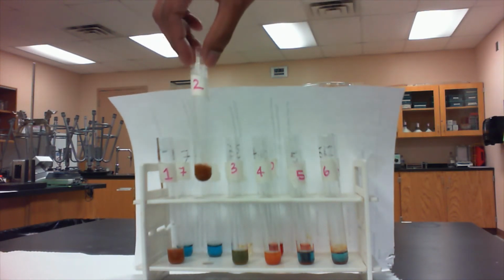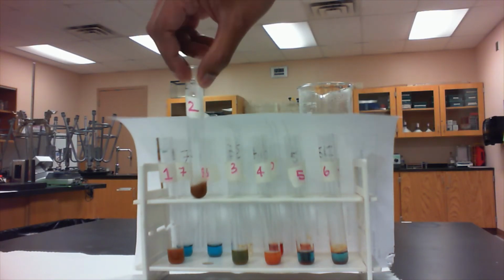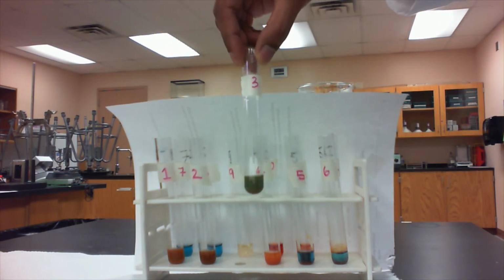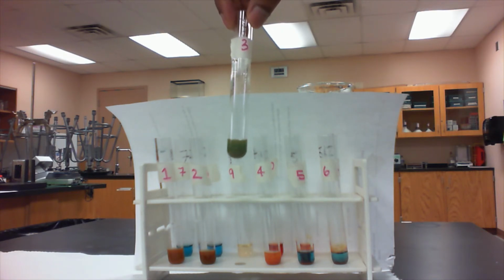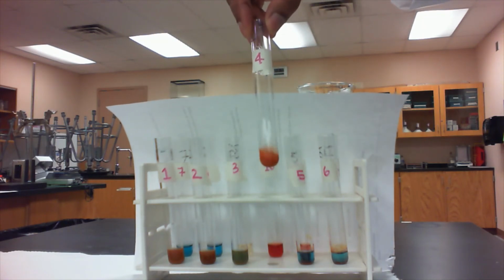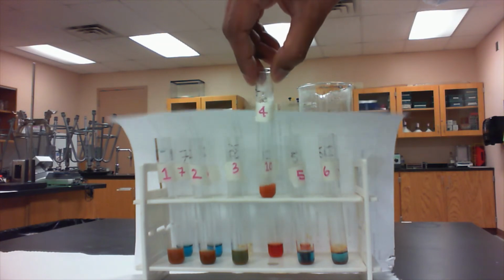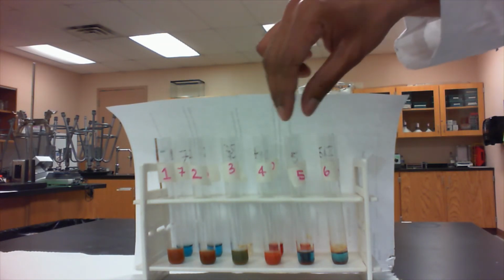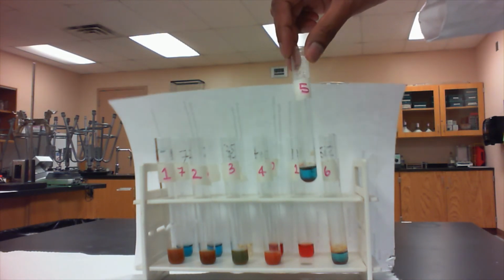This is test tube 2. Test tube 2 was fructose in the Benedicts reagent. This is test tube 3, which had sucrose in the Benedicts reagent. And this is test tube 4, which contained lactose in the Benedicts reagent, right? So remember, the Benedicts reagent is a test for reducing versus non-reducing sugars. Test tube 5, this is the Barford's test with glucose, right?